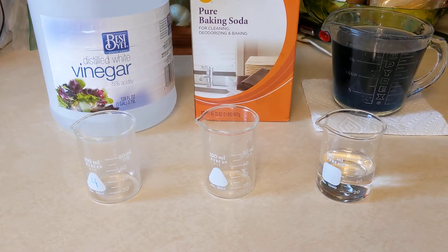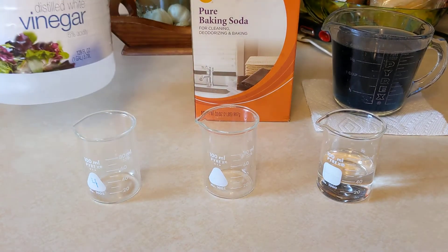For part three of experiment 19, we're mixing vinegar and baking soda and adding some of the cabbage indicator solution to them, then mixing the vinegar and baking soda together to see how the color of the indicator solution changes and the pH changes.